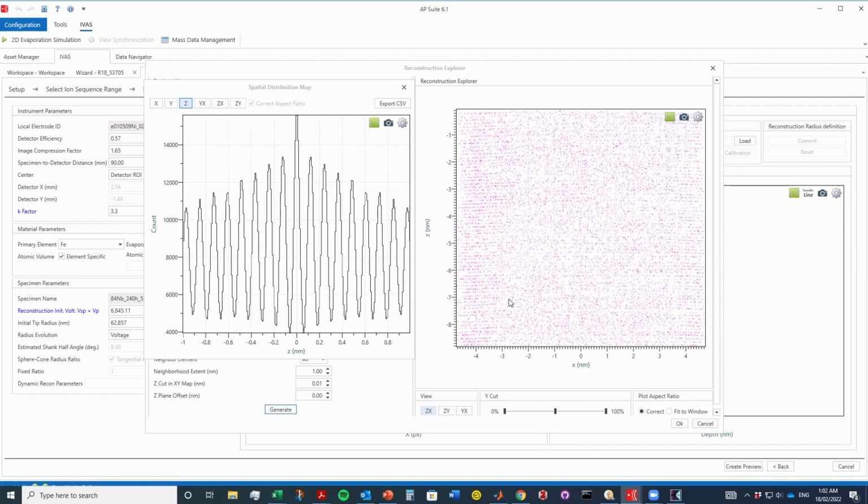It is a bit of a manual process at the moment, right? So there is a little bit of a human element to it. And yeah, I think as we get more automated methods, it'll get more and more precise. But at the moment, if you're roughly in the center of the pole, a little bit off is going to make very little difference to the final ICF that you calculate. It will make a bit of difference, but just try and get in the center.